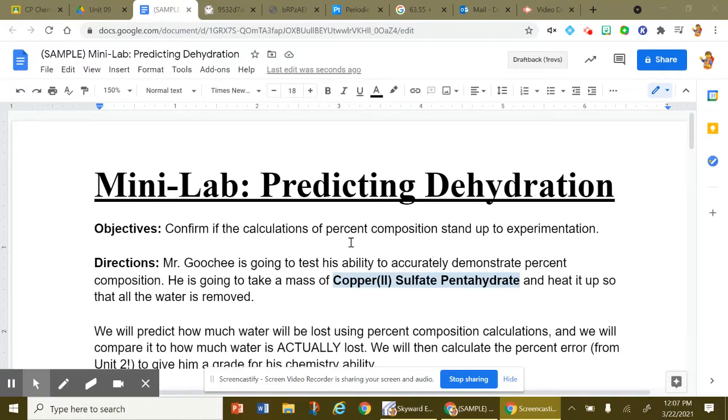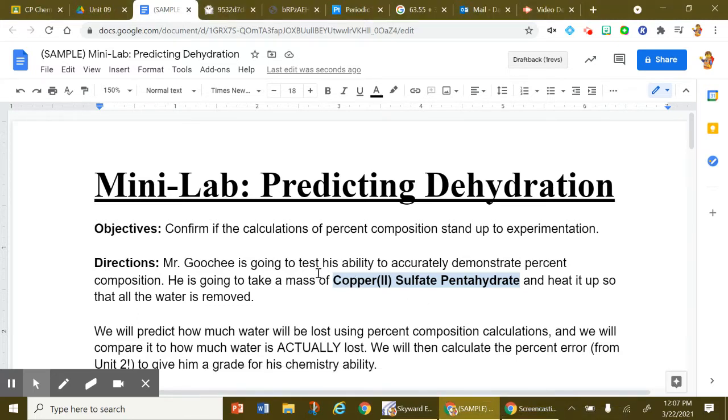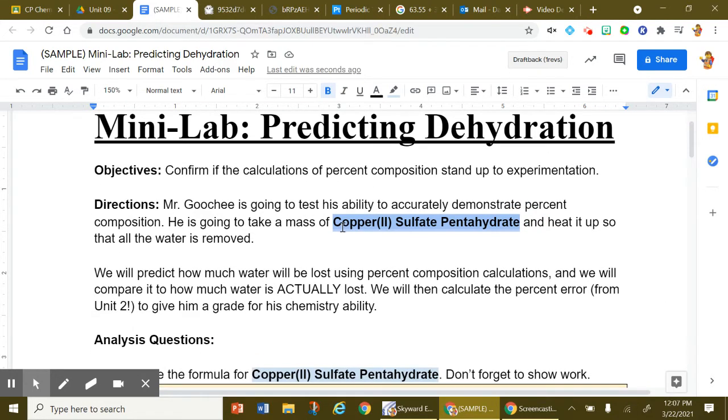This is your help video for your mini lab predicting dehydration. For this mini lab, I'm basically going to walk through and do this entire lab on this video, but I'm going to use different numbers and, in fact, a different substance than you. You're using nickel 2 sulfate pentahydrate. You're using a nickel 2 sulfate hexahydrate. I'm using copper 2 sulfate pentahydrate. So, again, I'm going to walk through how to do this lab, but you will need to do it yourself because your numbers are going to be different and the substance itself is slightly different.